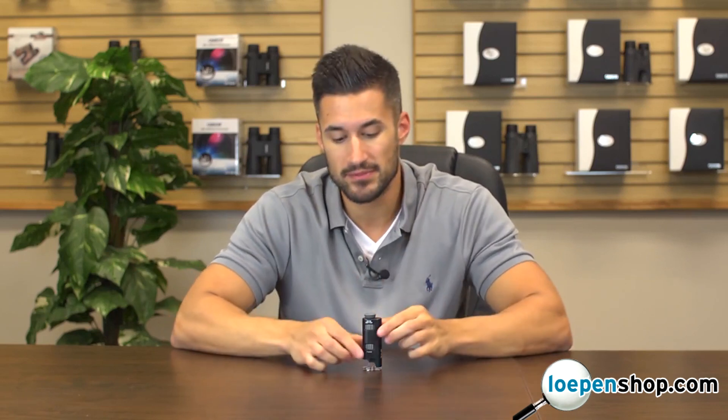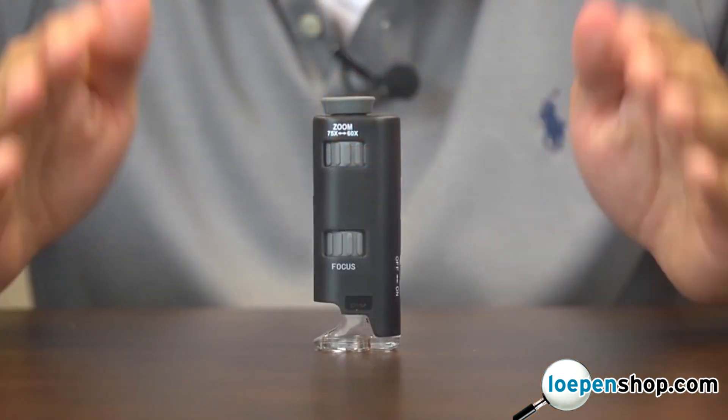Hey, what's up guys, this is Doug from Carson Optical, and today we're going to check out the MM200 MicroMax. This is an LED lighted pocket microscope that magnifies from 60 to 75 power. It's really easy to use and can bring out fine details in almost anything.